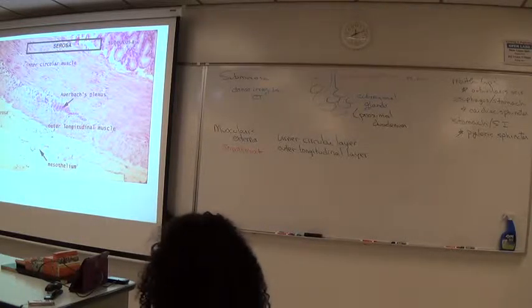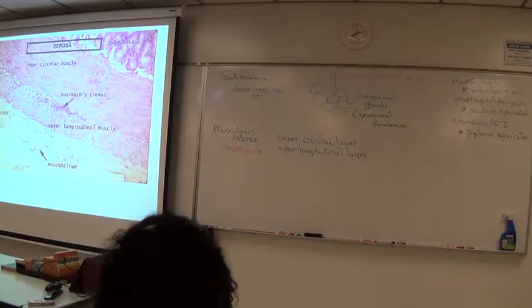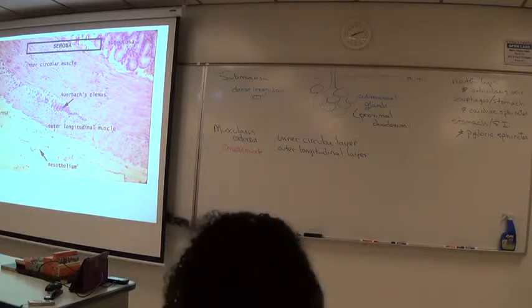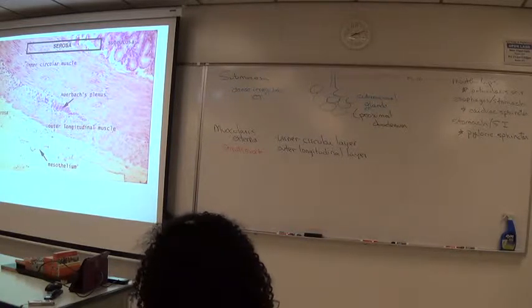So they are glands of the submucosa. No, we're small intestine, my dear. So where do we have submucosal glands in the small intestine? In the duodenum, exactly. So even though all you can see is that little corner up there, because those are submucosal mucus secreting glands, we only have them in the duodenum. Okay?